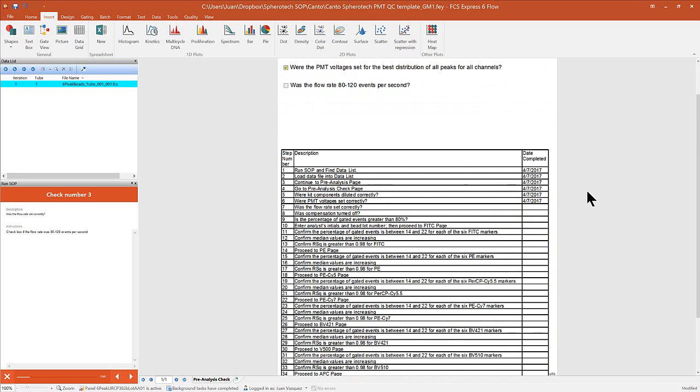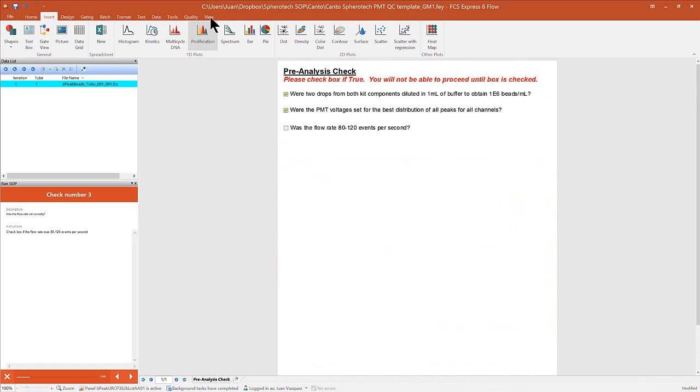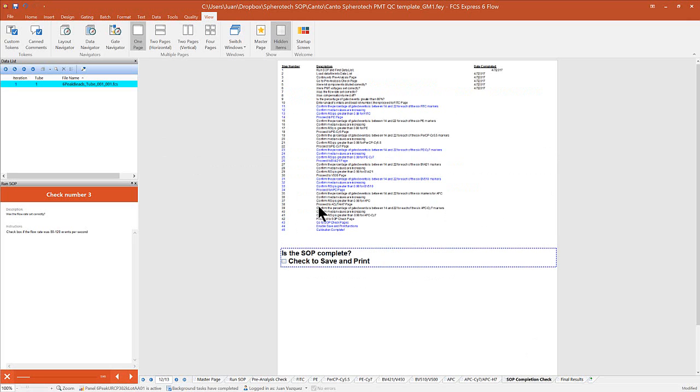Okay, and in this case we do have this integrated as part of this layout. So let me just undo that. So if I actually just show all my hidden pages, you'll see that this is actually a 13-page document where if I just go to one of my pages, you'll see here that I already have a table created as part of this template. Okay, so again, all these features are available as SOP.